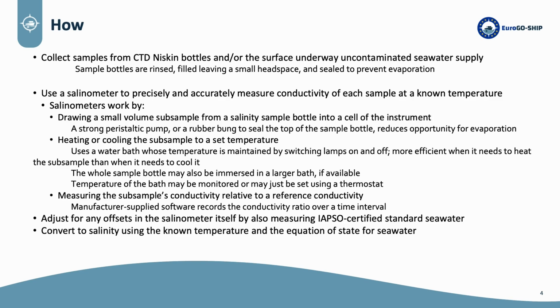The whole sample bottle might also be immersed in a water bath to make sure it starts out at near the right temperature. And the temperature of the water bath may be monitored, or it may just be set using a thermostat and lamps. Then they measure the subsample's conductivity relative to a reference conductivity, and generally manufacturer-supplied software can be used to record the conductivity ratio over a time interval of several seconds.